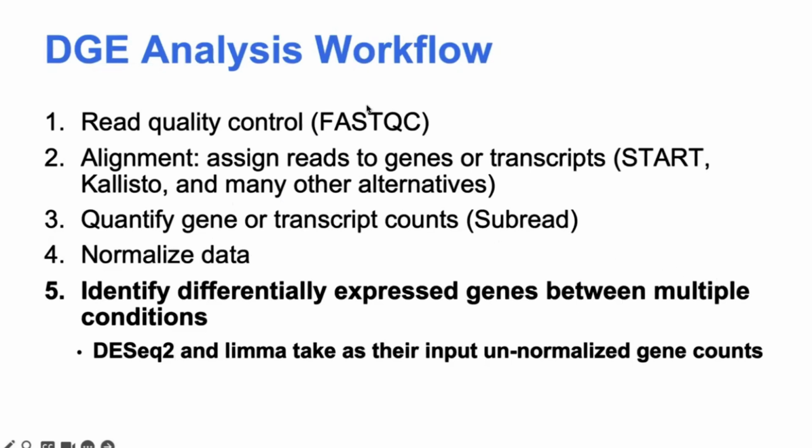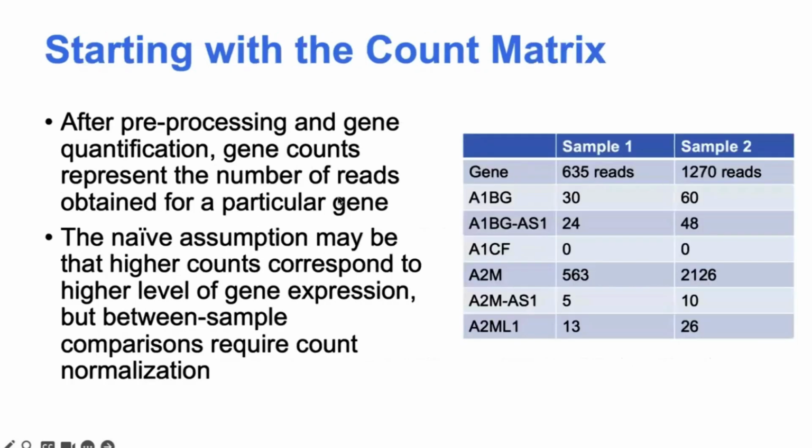I also want to note that this workflow, loosely outlined here, is what an RNA-seq differential expression workflow will look like. But differential expression analysis in general is a method you can also apply to other data types, such as protein expression and other omics data. Those data types behave very differently, so they'll have their own specific pre-processing and analysis tools. For today's lecture, we're going to assume that all the data we're dealing with have already gone through the alignment and quantification pre-processing steps.